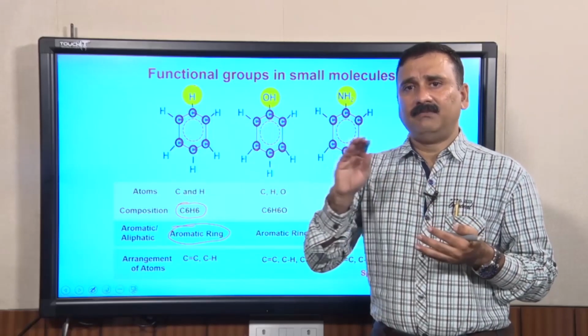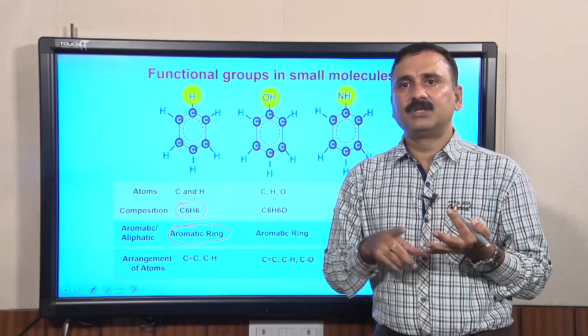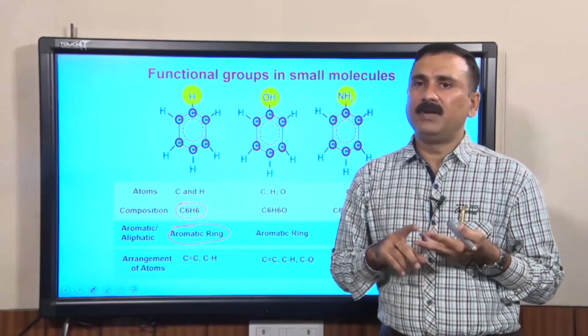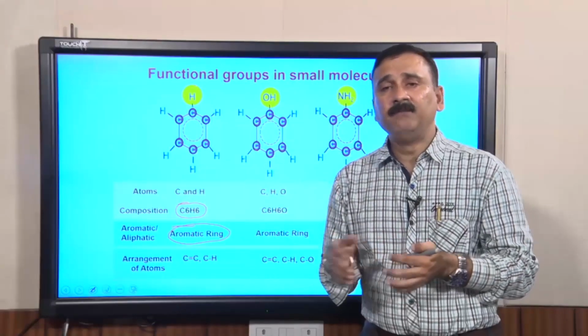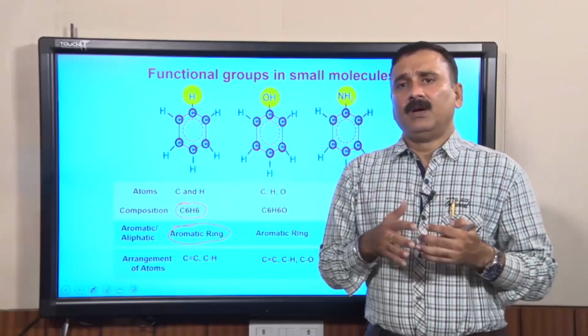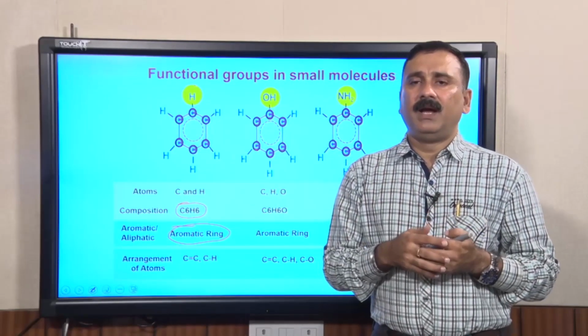So, by combining different techniques, whether it is CHN analyzers, UV-visible spectroscopy, IR spectroscopy, or other techniques such as NMR or X-ray crystallography, you can characterize compounds. And with this we would like to conclude our lecture here. Thank you.